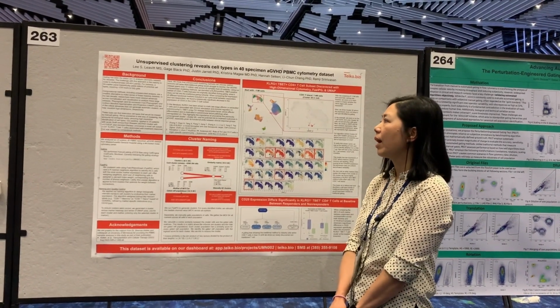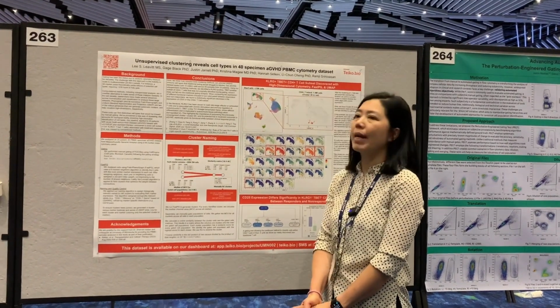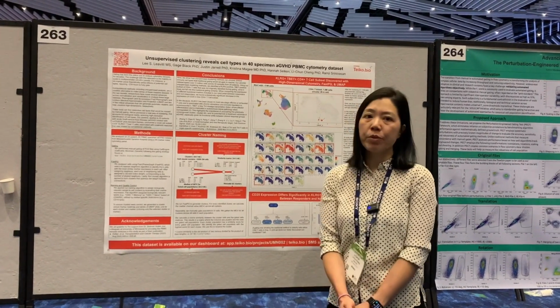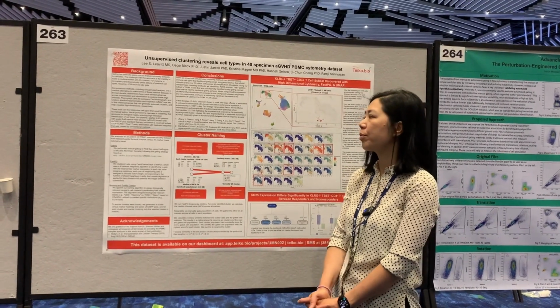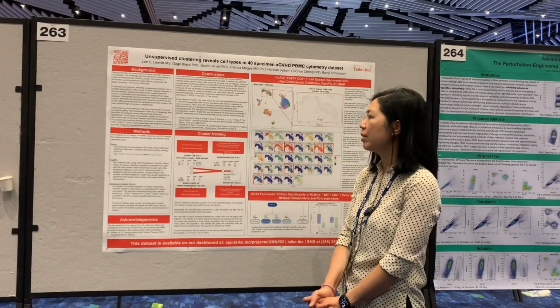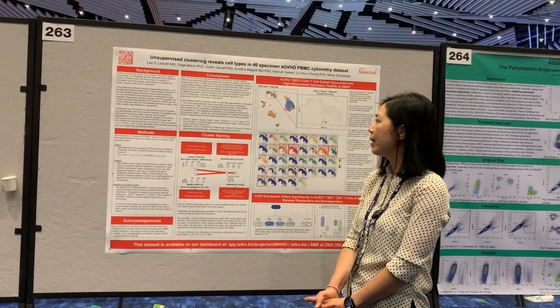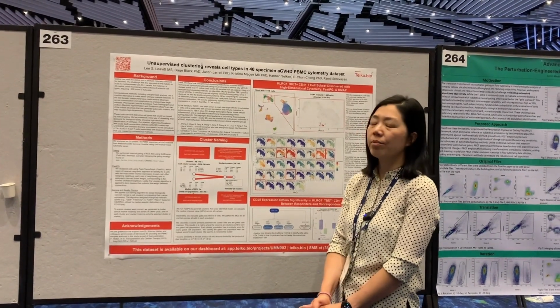Here we are going to present one of the clusters that we identified using this method. We generated the FCS files using mass cytometry assays with this 44-marker panel. We did some manual gating in parallel just to compare the performance of our unsupervised clustering. For the computational method, we used FastPhenoGraph to do the clustering, followed by an in-house built tool to name each cluster.